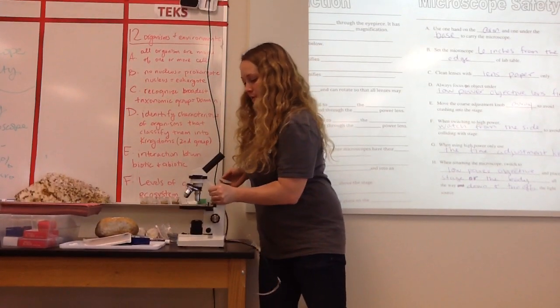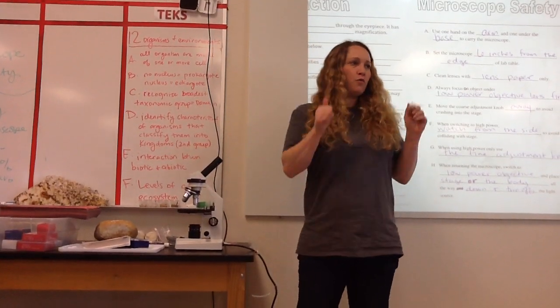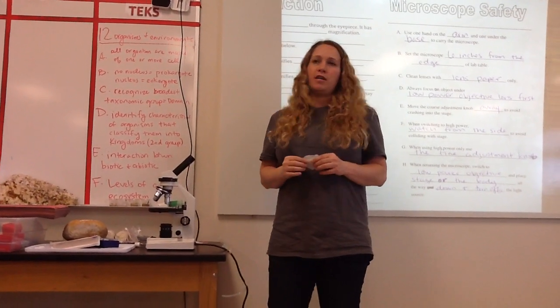So 6 inches from the edge, nice and clean. We're good to go. Okay? What are you never going to use?